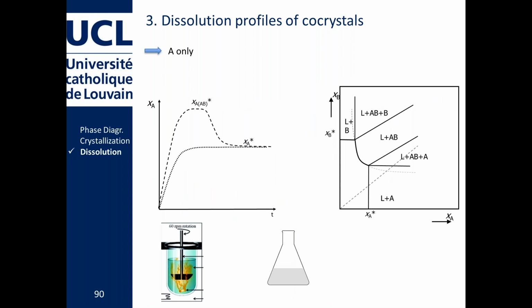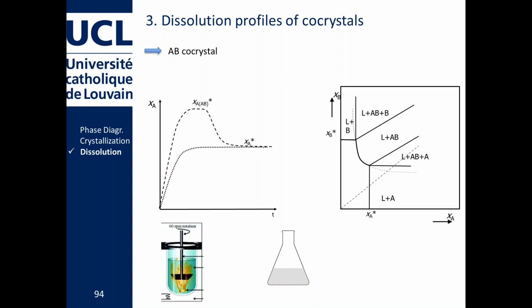You cannot change your system now. Don't forget that we're in the body, so I'm stuck with my simulation of my stomach fluid. So I cannot change the solvent. I'm not going to go to methanol here. So I'm stuck with the nature of my solution. I do the same. I add caffeine. If you add caffeine, nothing has changed. Caffeine will dissolve up until the point that I reach the maximum amount of caffeine that I can solubilize in my stomach.